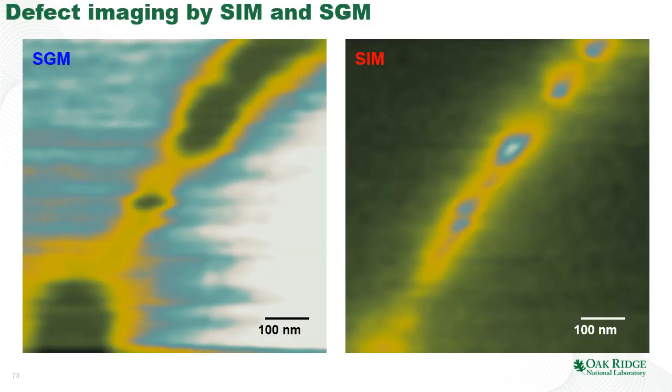What's very interesting is that the spatial resolution of these impedance measurements in this self-gating regime is much higher than the spatial resolution of the SGM. Because in scanning gate microscopy, once our tip bias is strong enough, we suppress the current inside the nanotube to zero, and therefore we cannot measure anything anymore. If we increase the bias magnitude, then we start to suppress the current at larger distance. So the higher the bias, the poorer the resolution. In scanning impedance microscopy, we measure the residual transport in the nanotube. So we are sensitive to much more subtle changes in the conductance across the nanotube, and therefore our spatial resolution ends up being much higher.